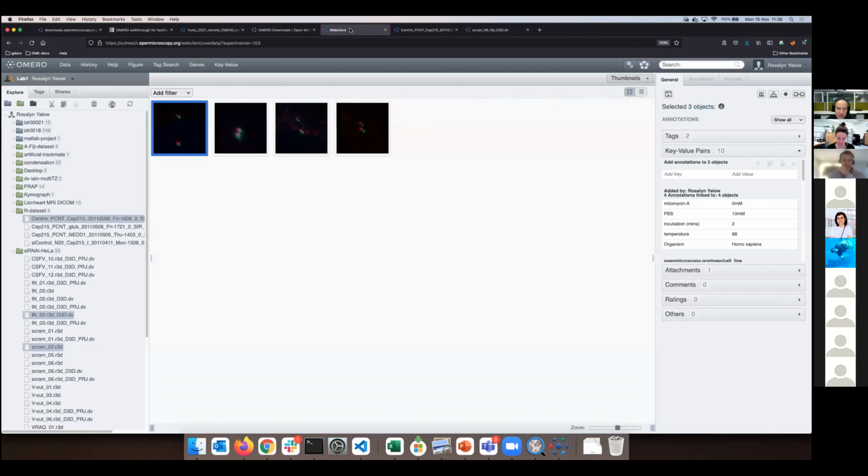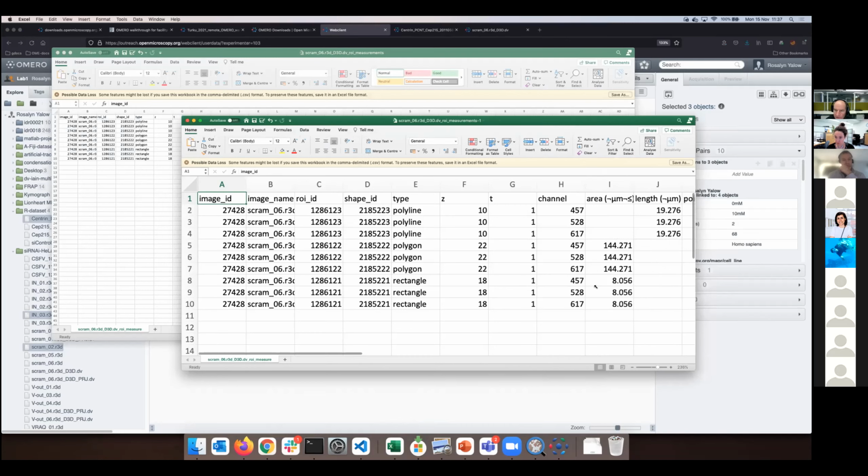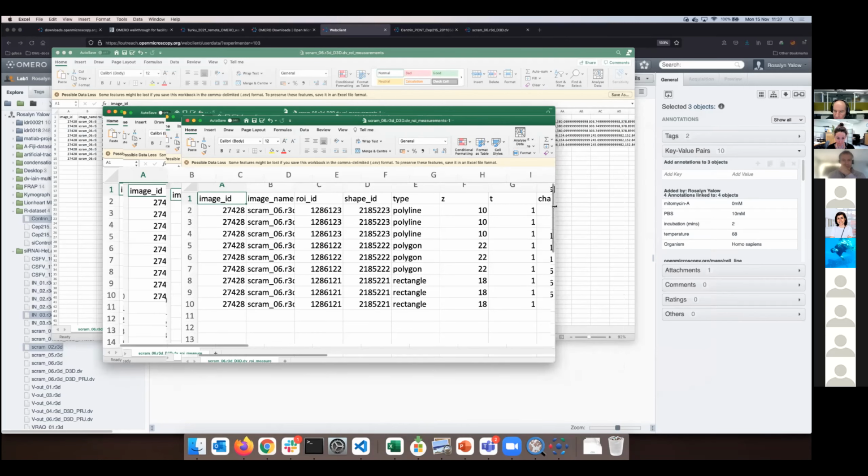There is yet another. Yes, I have another question. Go for it. To address Johanna's question, each of the rows in the file, does it represent the cells, or what does it represent? Okay, thank you. So this is actually a very nice question, because it goes into my flow.